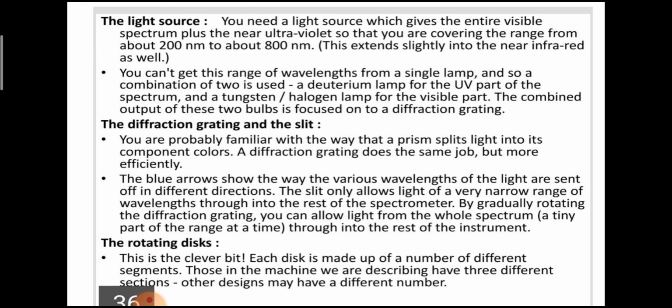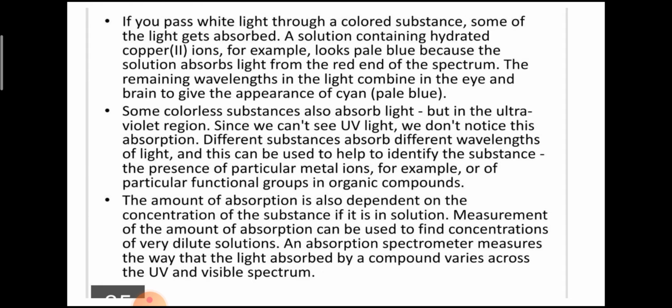This is the clever bit. Each disc is made up of a number of different segments. Those in the machine we are describing have 3 different sections. Other designs may have different numbers.